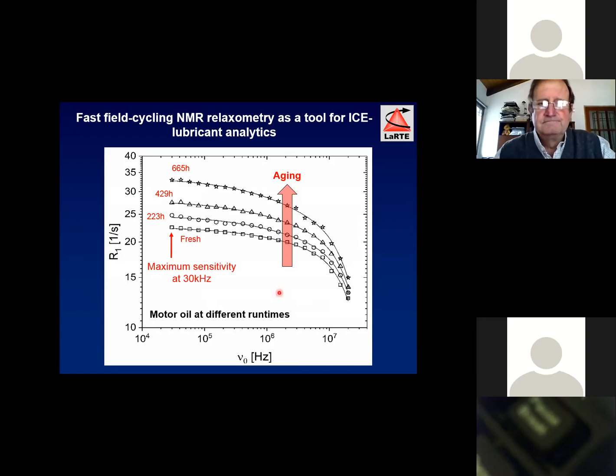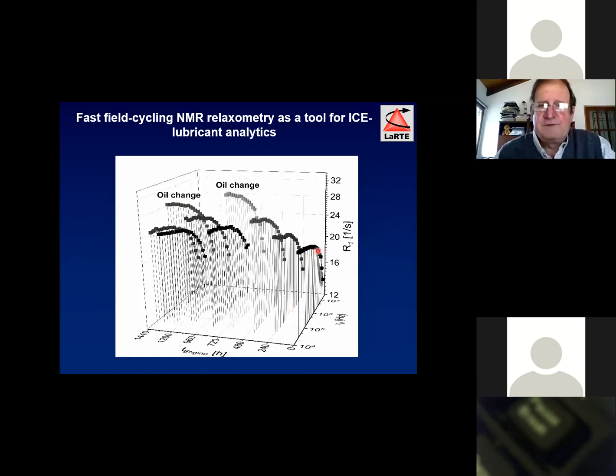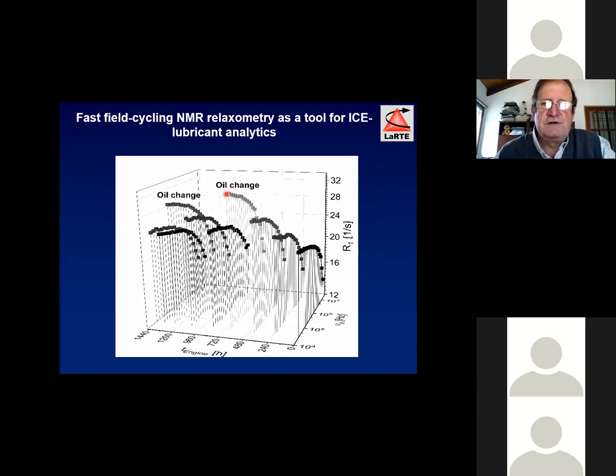You see here, depending on the runtime of the oil in a new test engine, from fresh oil, as you degrade the oil with aging, the relaxation rate increases in all the frequency range, and again, the maximum sensitivity is at the lower frequency. This shows the dispersion as a function of the time of use of the lubricant in the engine, when you change the oil in the engine, and so on.